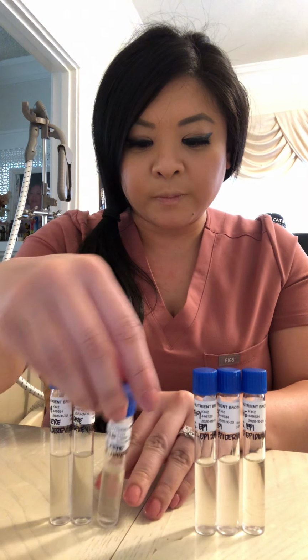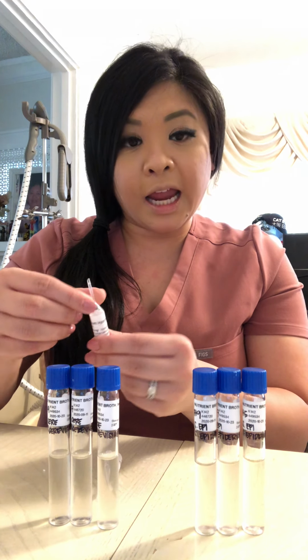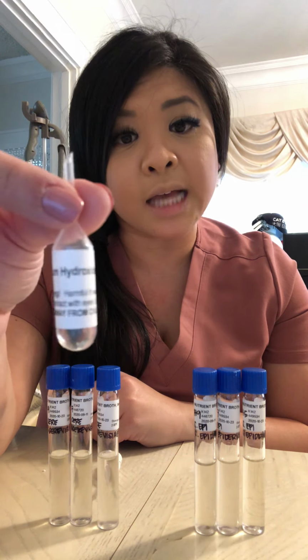Next, I have my pH testing results. I did find this pH testing interesting as well because typically the broth is at a pH of 7, and we use the HCl, or hydrochloric acid, agent to decrease the pH, and we use NaOH, sodium hydroxide, to increase the pH.